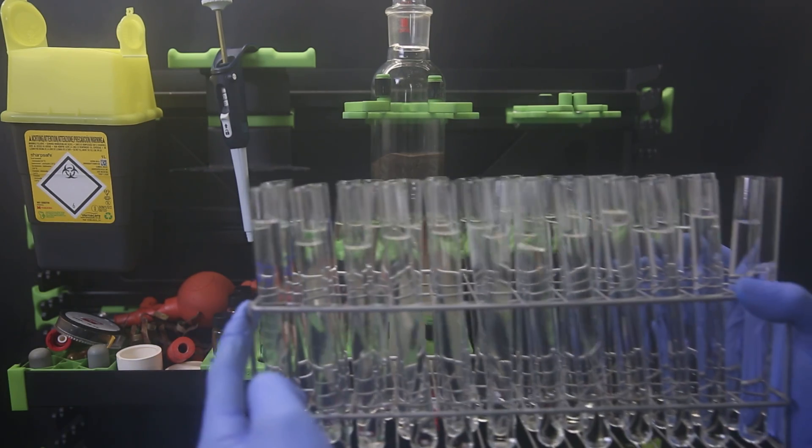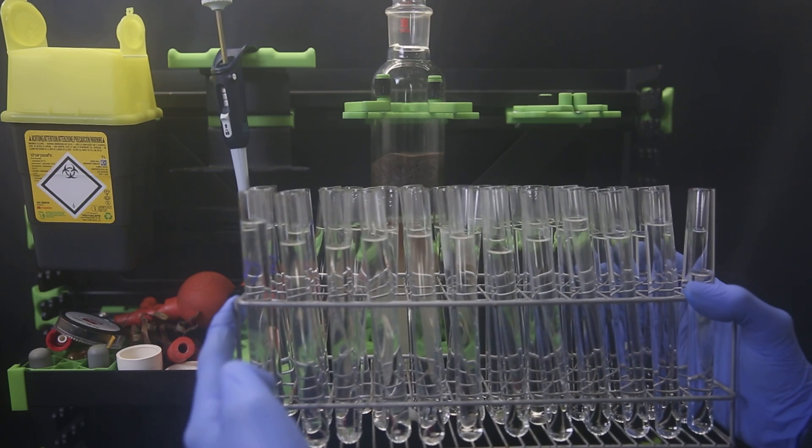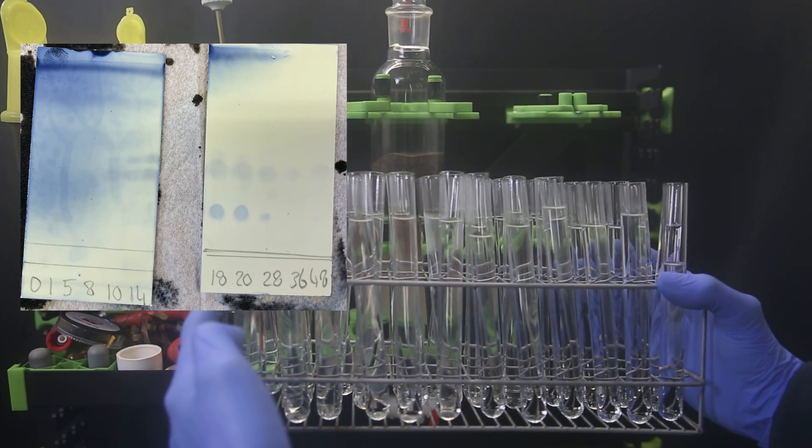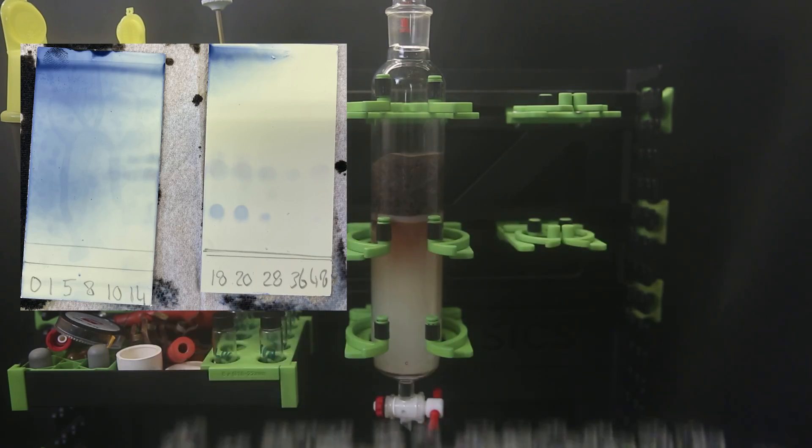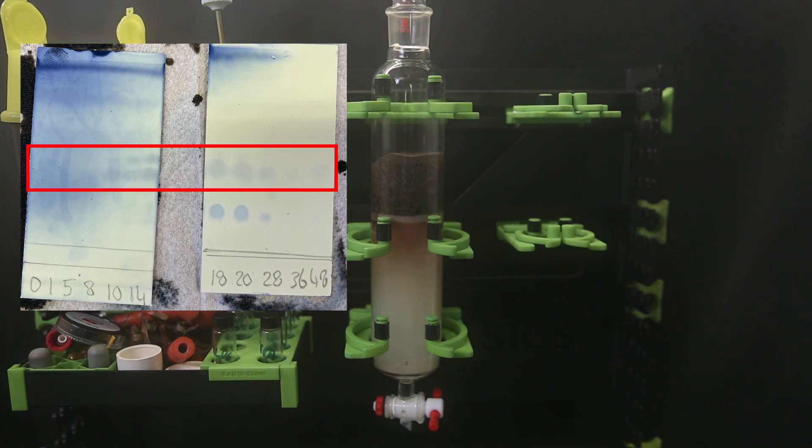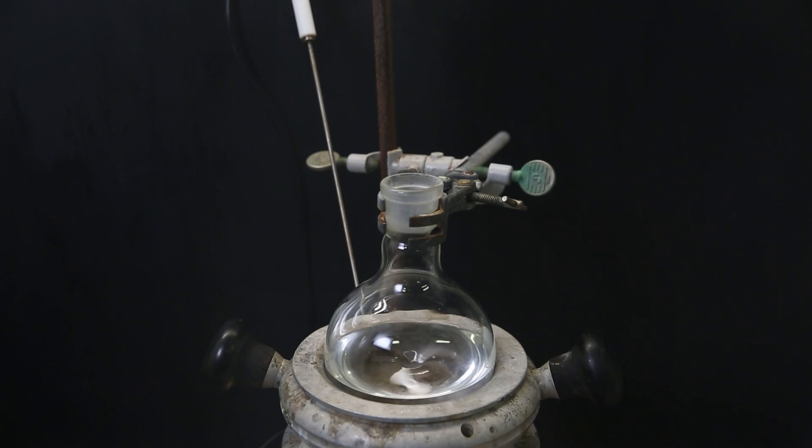When that's done, I have collected about 48 fractions plus one bigger fraction at the start. Checking some of these fractions on TLC, it looks like the middle spot is actually two spots close together, and it starts to be visible around fraction 10. So I will just take fractions 10 to 48, combine them, and evaporate them down.